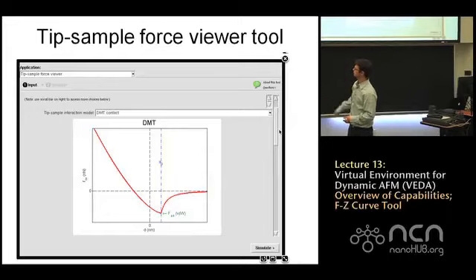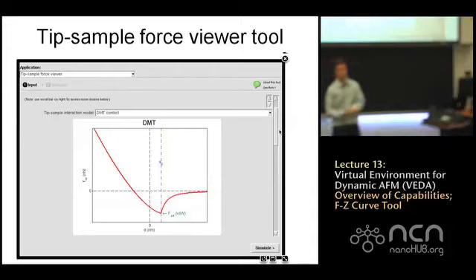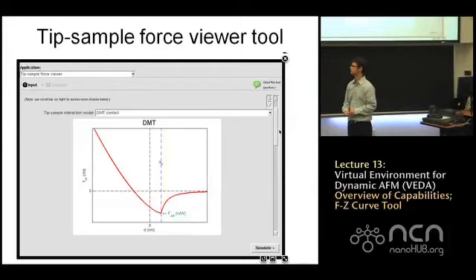And we assume this is continuous, but it works out to be non-smooth. And then after we start indenting the sample, the repulsive forces are modeled by Hertz contact mechanics. So for any gap less than A0, we're said to be in contact with the sample.